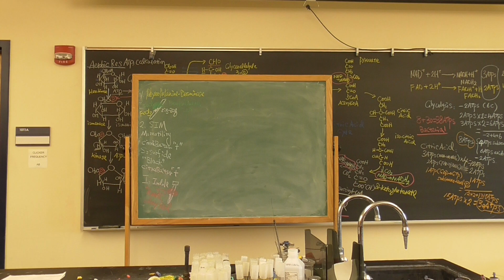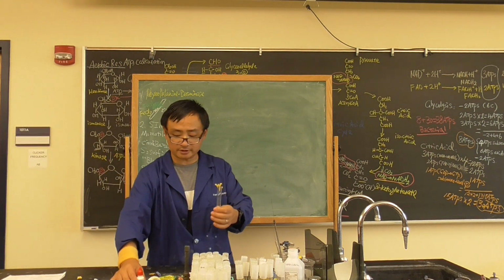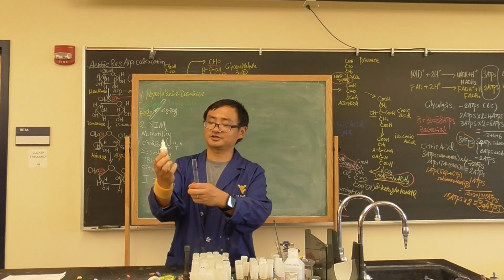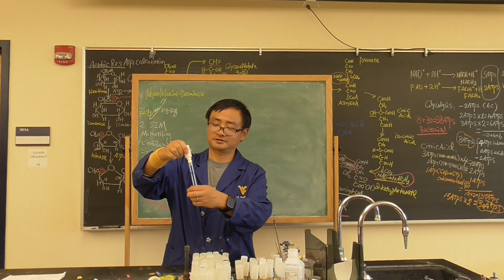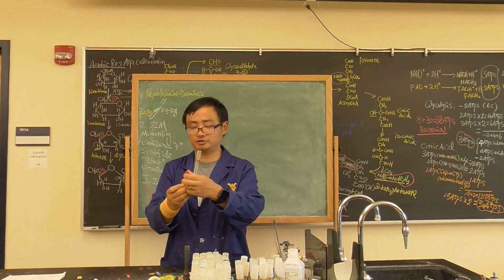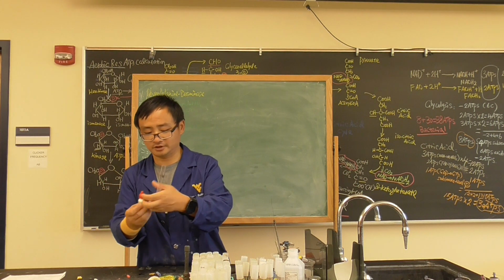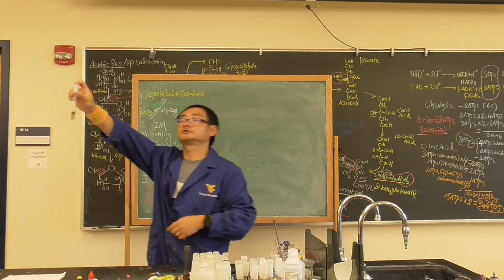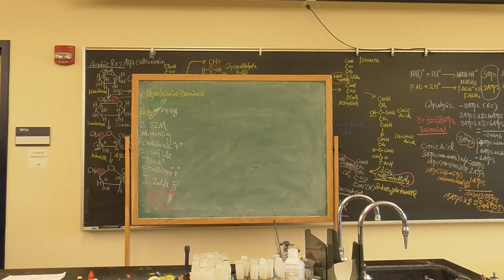Emma, go back. Figure it out. Okay, we'll see where the 10 points are going to go back. Let me do this first. This one you need to shake. Okay, a couple of drops. This is Citrobacter, shouldn't be positive. Okay? Shouldn't be positive. Nothing happens. Good. Citrobacter is negative. You go ahead and do the test by yourself, okay?